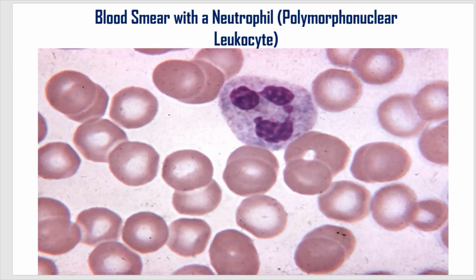Okay. Now, this slide here is the blood smear that is showing the neutrophil.